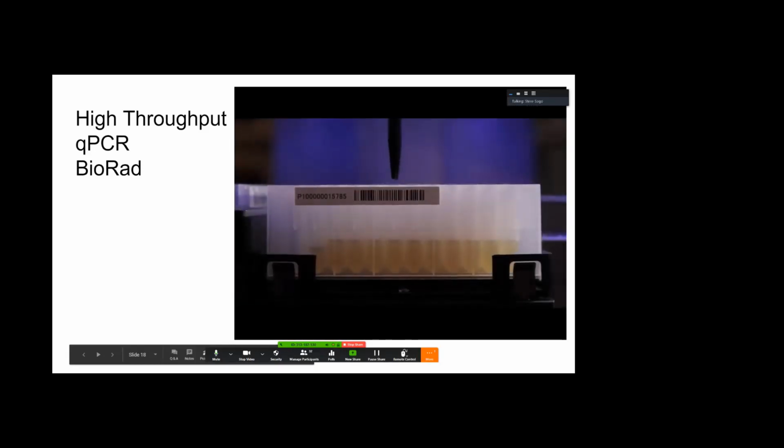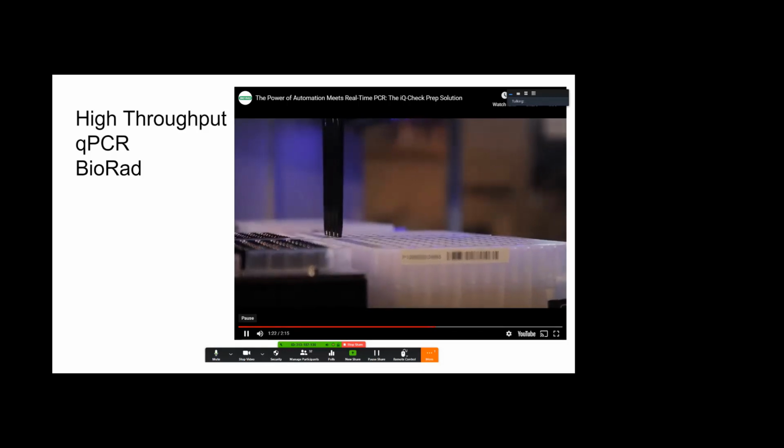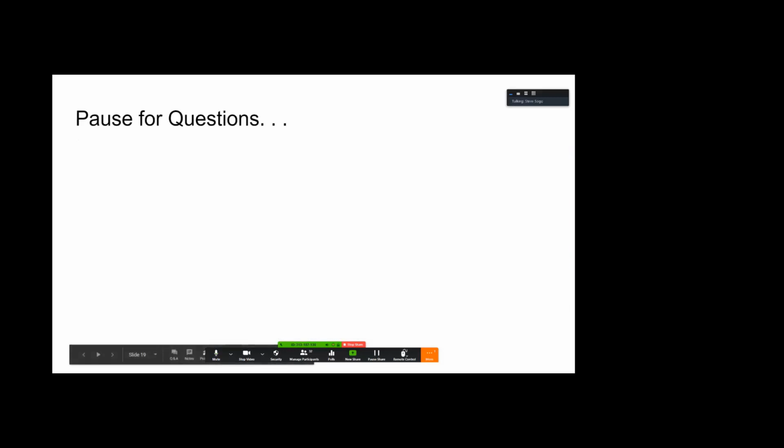So it has all the chemicals that are needed. It has the thermocycler that's needed. These are expensive machines, but you can see how it works. So it's much better than doing one person at a time. Okay, so that's probably enough for that.